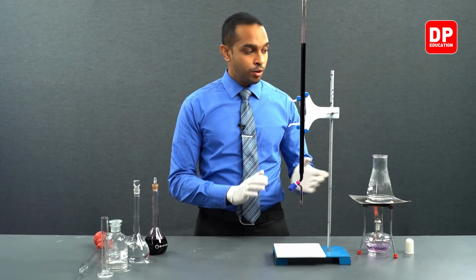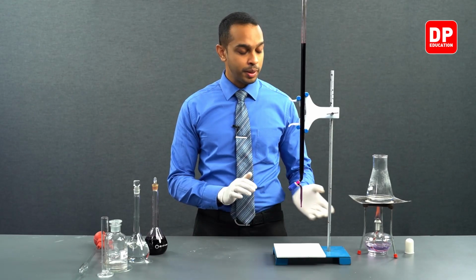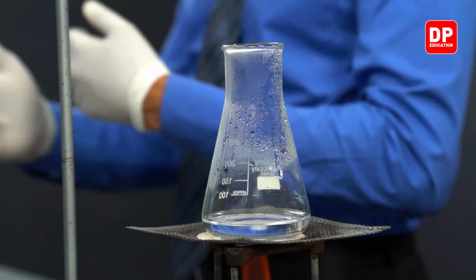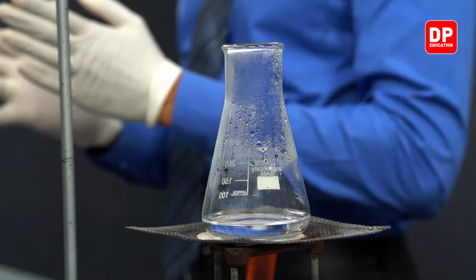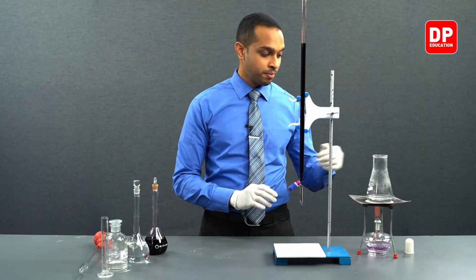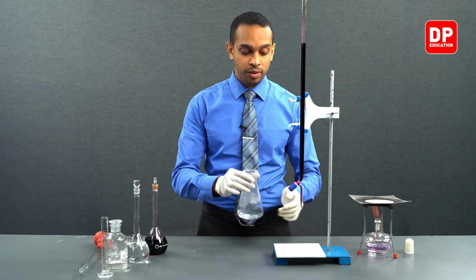That is why we have placed this again on our spirit burner, so that the reaction can happen faster and we can see a clear endpoint at the end of this titration. Now, let's continue on with the titration.